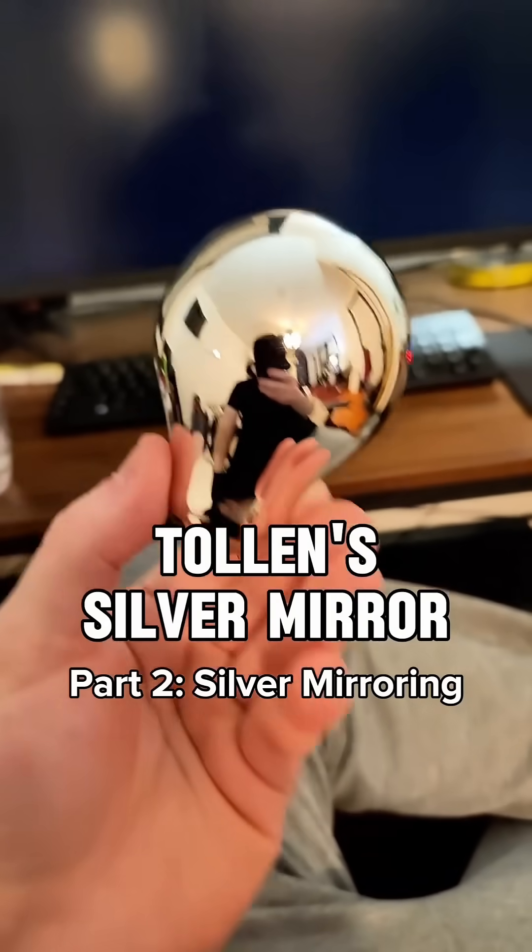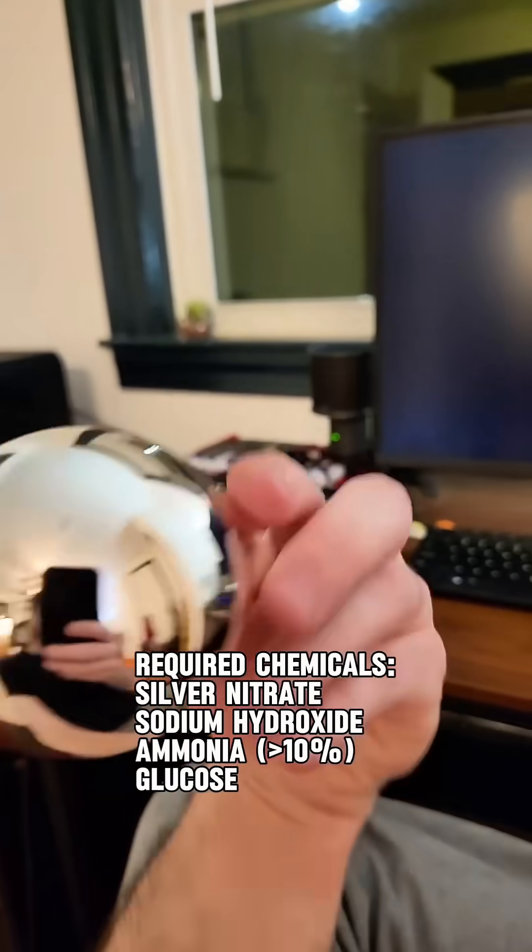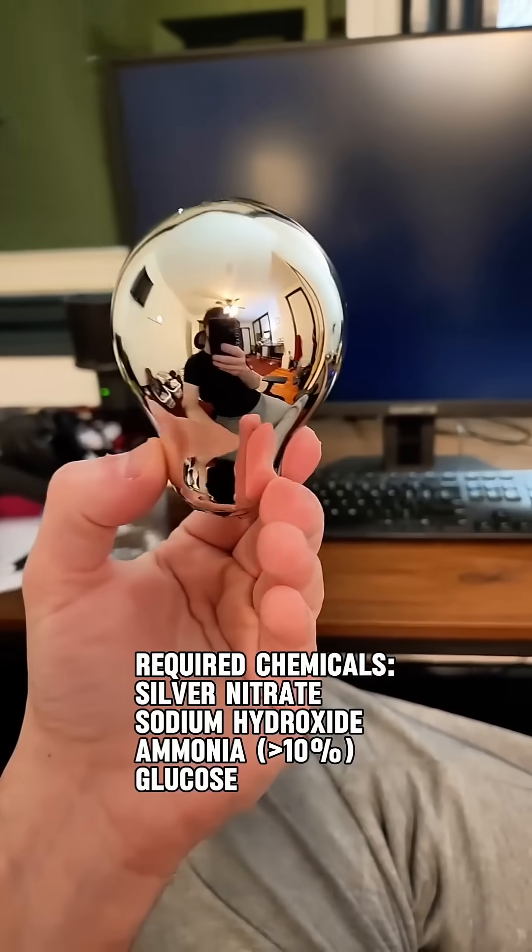Today I'm going to show you how to use Tollens Reagent to apply a perfect mirror finish to anything you can think of. This is an old light bulb I silver plated, and I think it's one of the more beautiful things I've ever made.